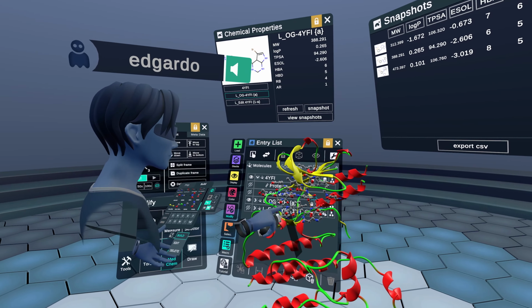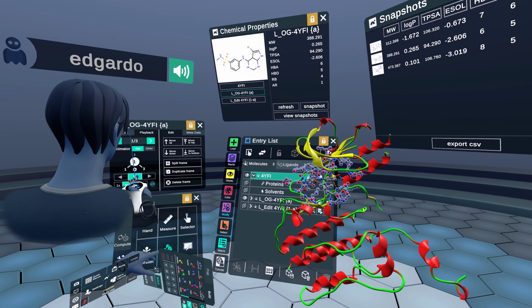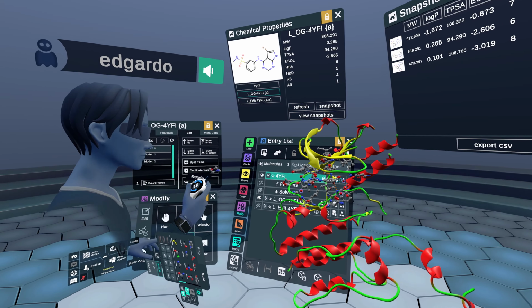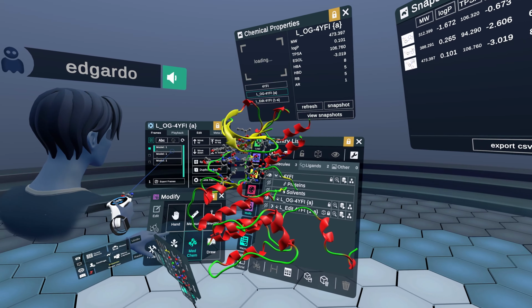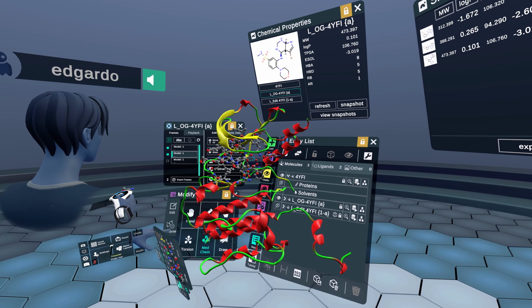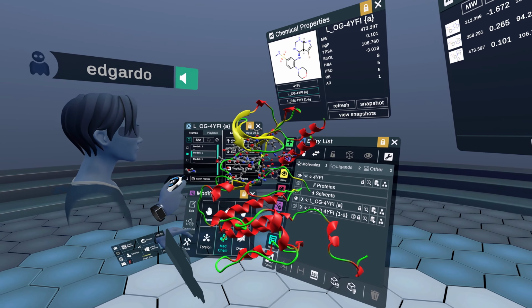And if we wanted to export the designs of the small molecule, you could go over here to the frames. Let's say we wanted to export this first model. You can see that by clicking on these different frames, you're cycling through those both here and on the frame menu. And let's say that the example with the morpholine is our favorite one that we want to export.